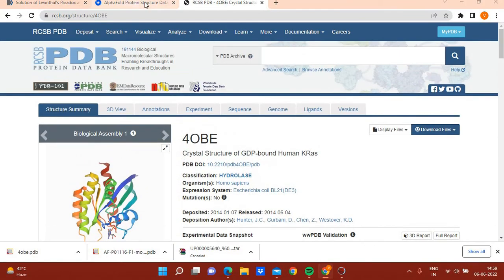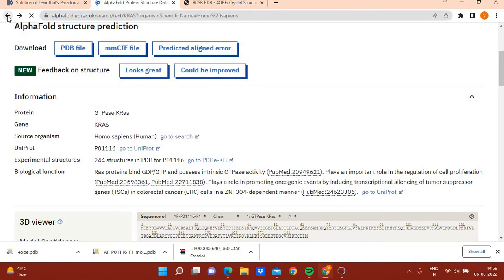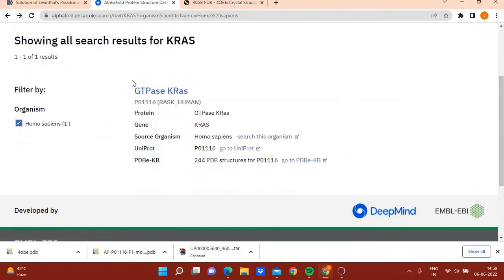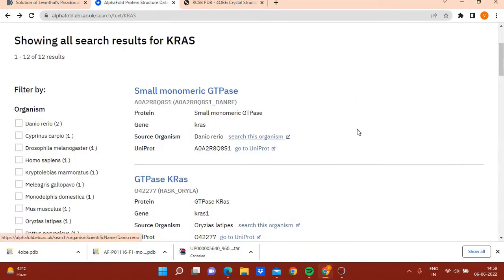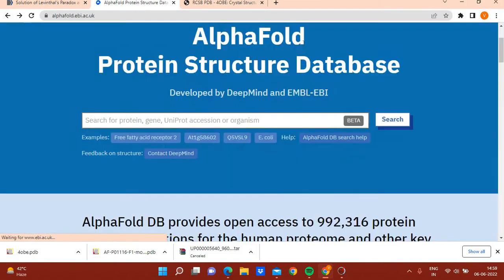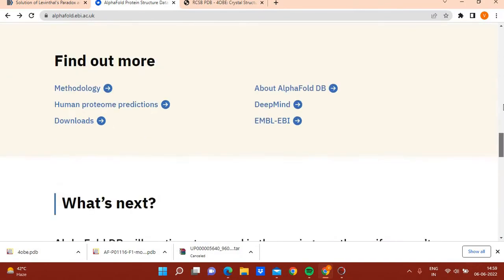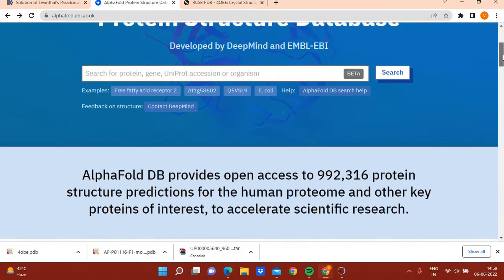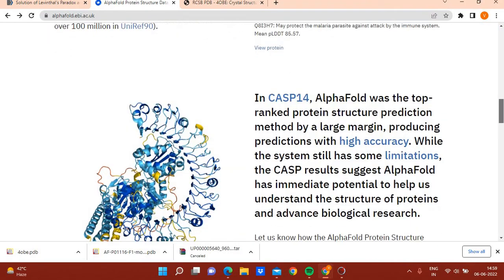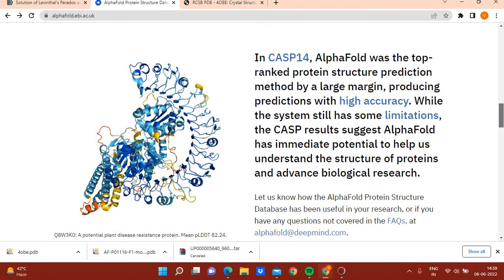AlphaFold actually predicts a structure which can be used for drug discovery, design, and other molecular modeling purposes. You can explore the AlphaFold protein structure database, download any human protein structure, and also download the entire human proteome. In CASP14, AlphaFold was the top-ranked protein structure prediction method by a large margin, producing predictions with high accuracy.